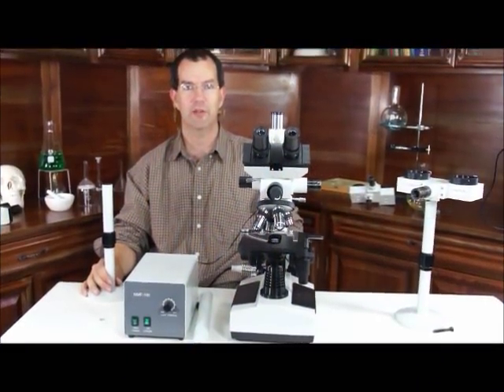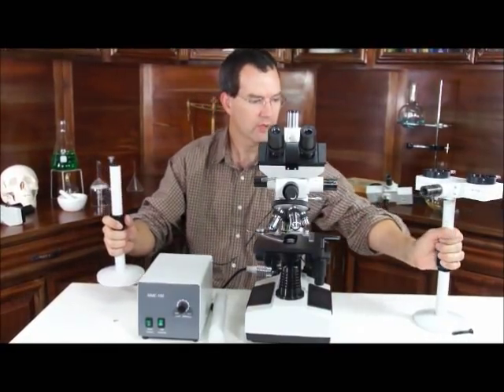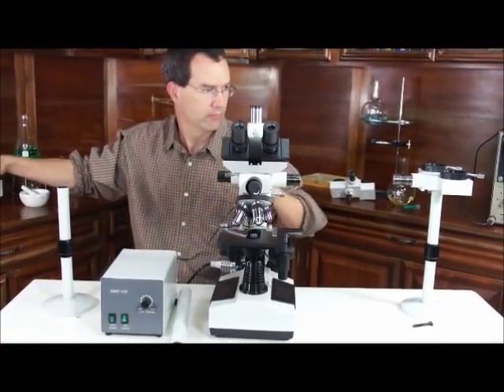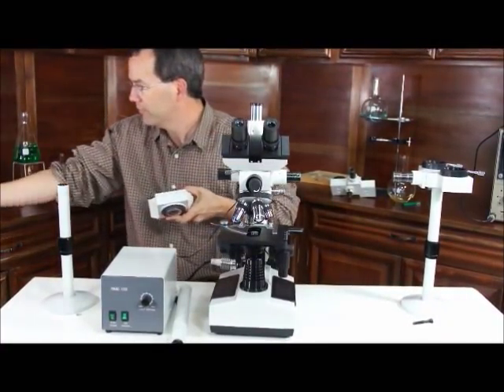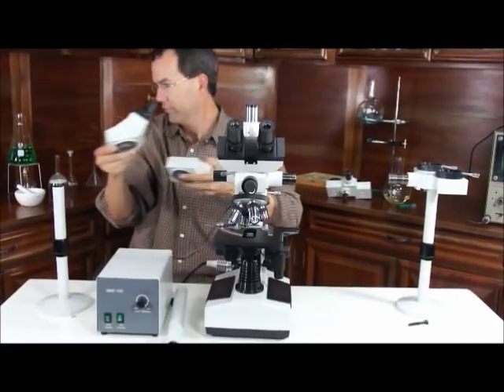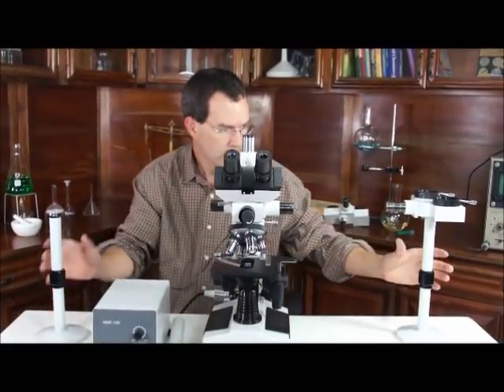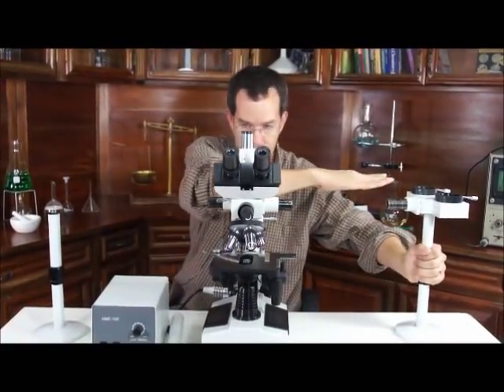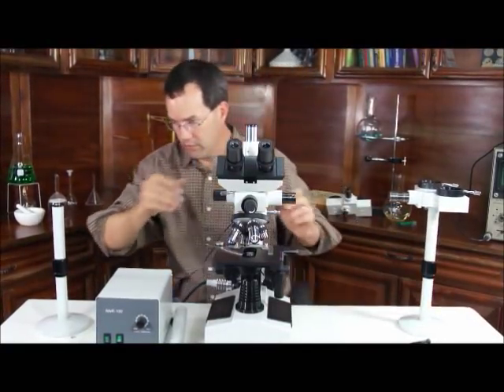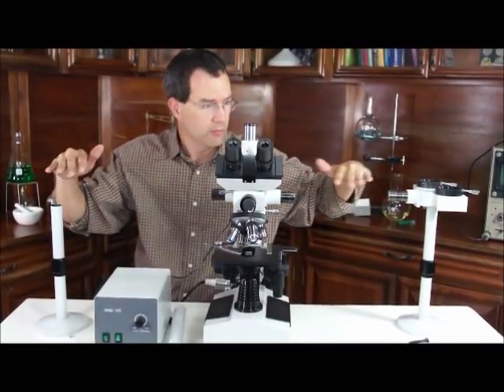We're right in the middle of the assembly of the five-head microscope. We have on the left and the right the stands for the outer heads. One thing you have to do is line up horizontally — make sure everything on the left, on the right, and the center is on an even plane.